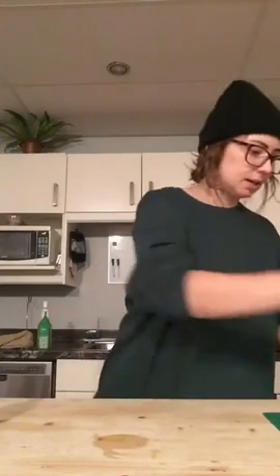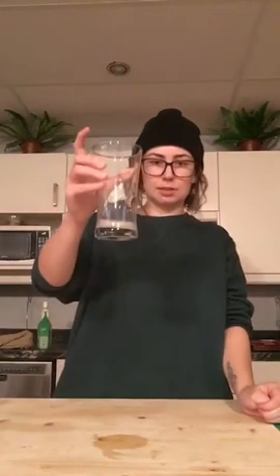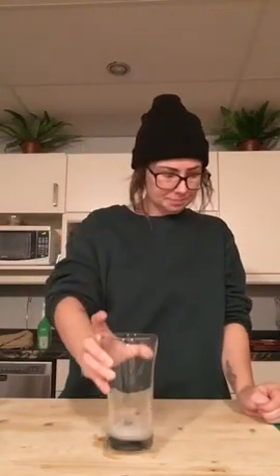Alright, I just took this out of the freezer. It's been in there for 10 minutes. And I'm going to add a small amount of hydrogen peroxide to this. So that has the most out of all of them.